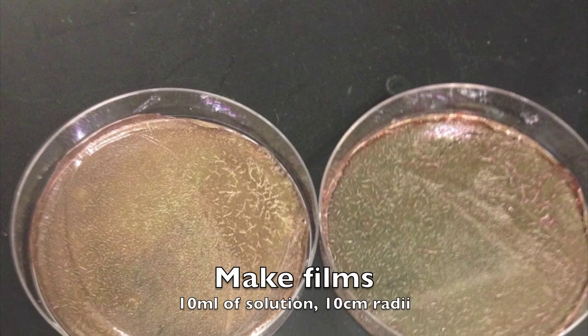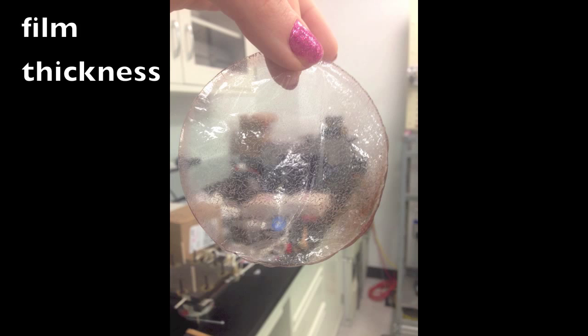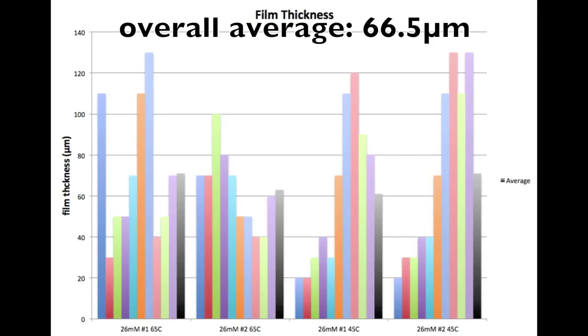The solution was then poured into petri dishes and left to dry overnight to make a film, which was then analyzed for the various film thicknesses. We took various measurements and the average film thickness came out to be around 66 microns, which is not too far from what our design goal is.